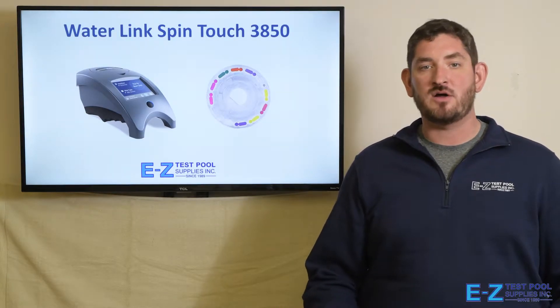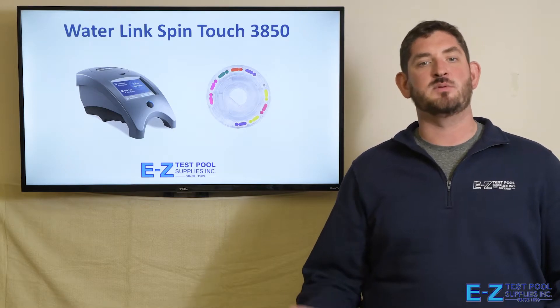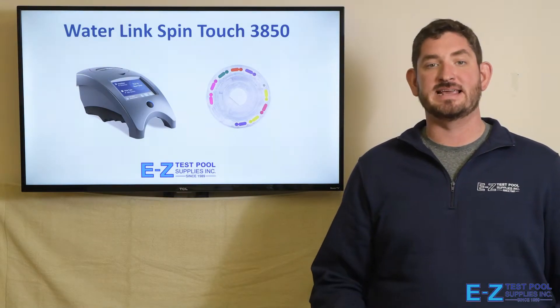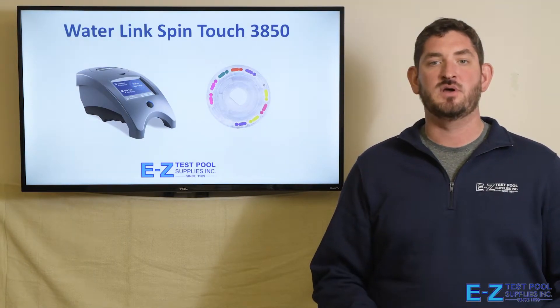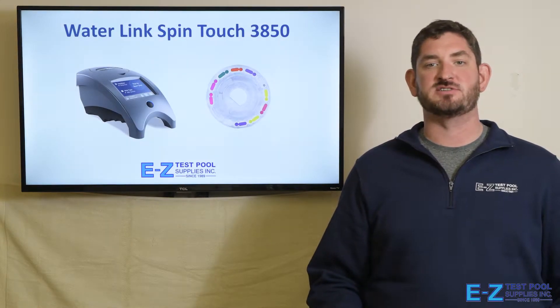So you have a service crew. You're going out cleaning pools, checking water chemistry, but usually that involves taking a water sample back to the shop, running it through the machine, and then heading back out to the site to take care of the pool. With the Waterlink, you're able to bring a portable water testing device into the field with you, where you're able to get instant analysis right there and treat the pool without having to make a return trip.